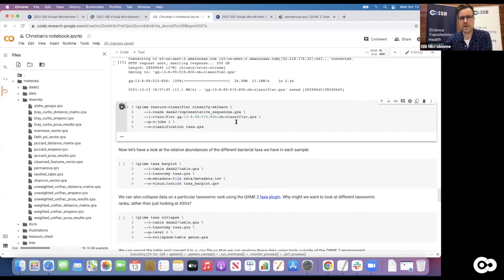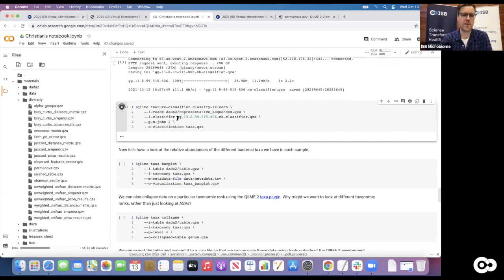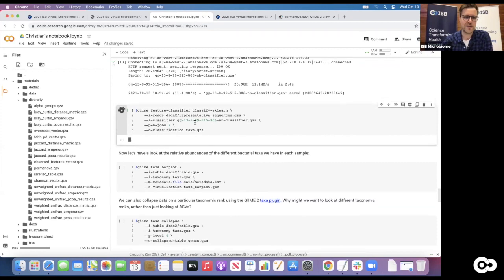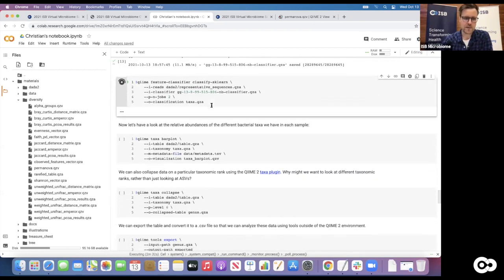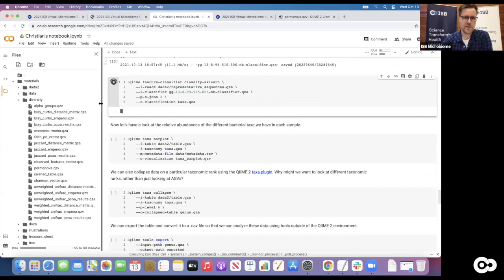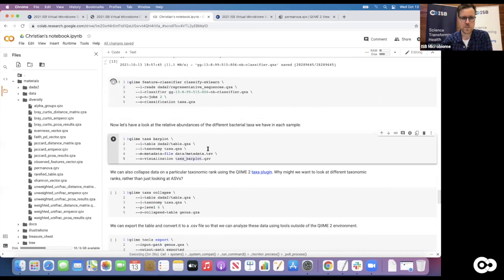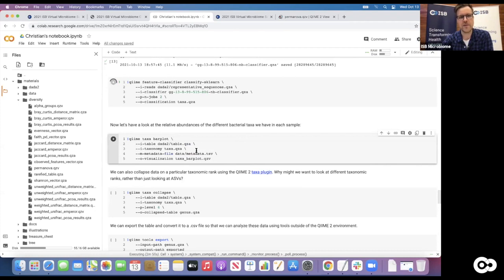That will take a little bit here - it shouldn't take too long since we use a smaller database. If you use the SILVA database, that step can take quite a bit longer. As always, we add parameters like n_jobs or n_threads which tell you how many CPUs to use - if you have a computing server with a lot of CPUs you can ramp them up and run faster. That will give us assignments of the taxa. Now we can actually look at it and create a visualization - one thing that would be interesting is to see what is the composition of taxa actually in each of the samples.